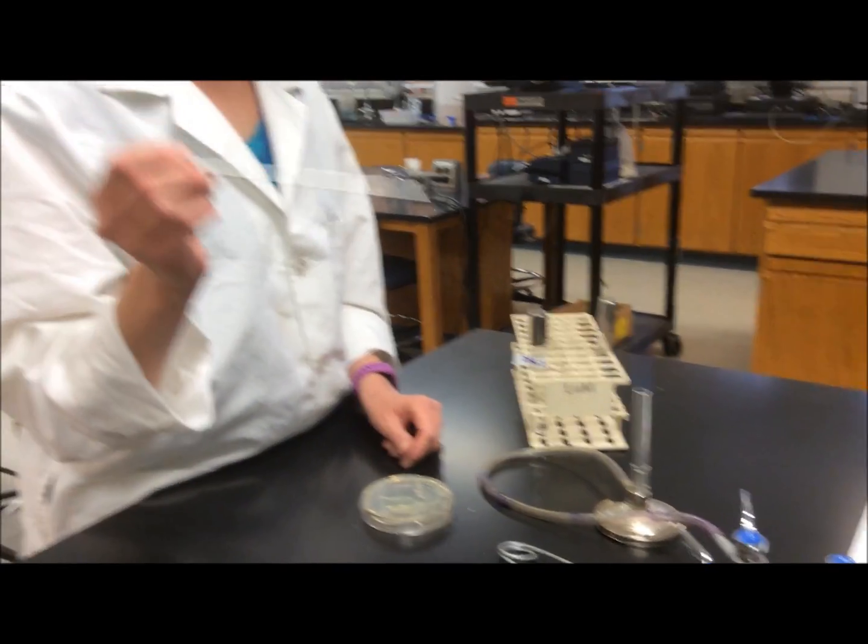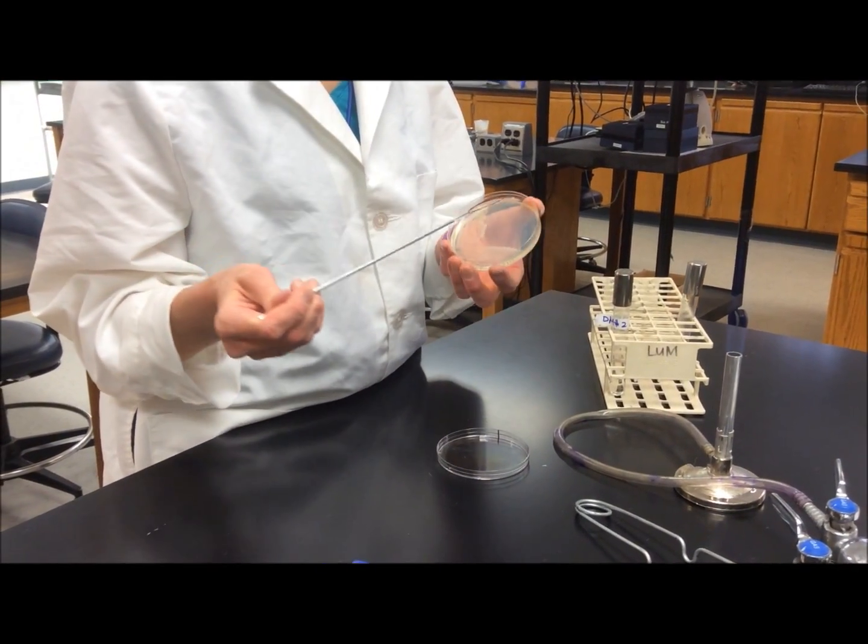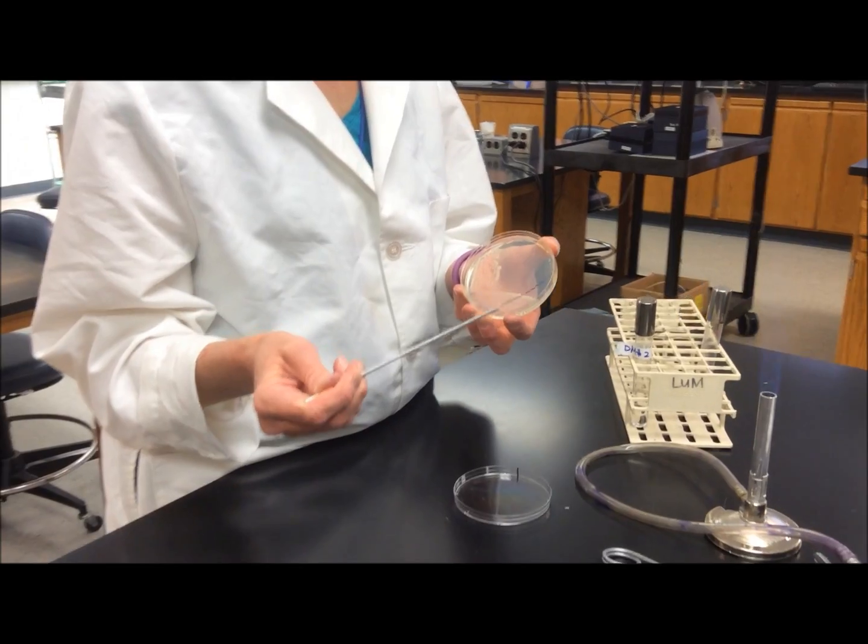Since I flamed and sterilized my inoculating loop, it might still be hot. So before grabbing a single colony, I need to cool the loop.